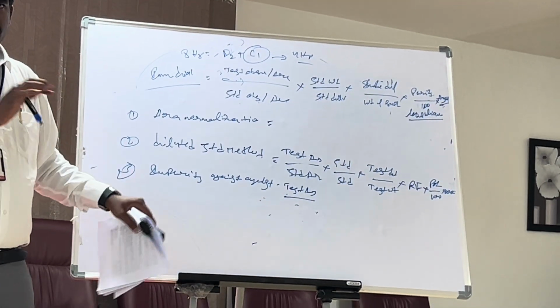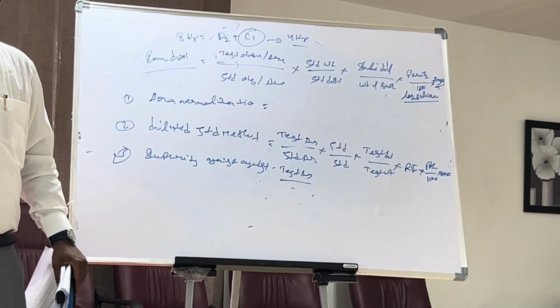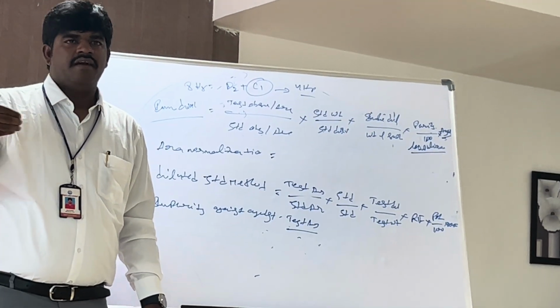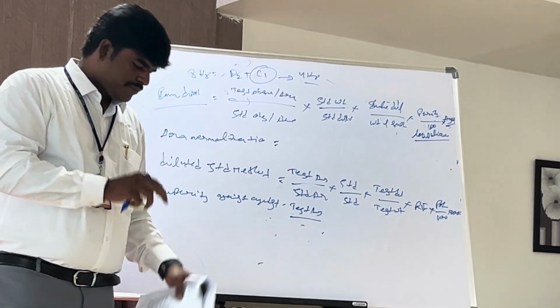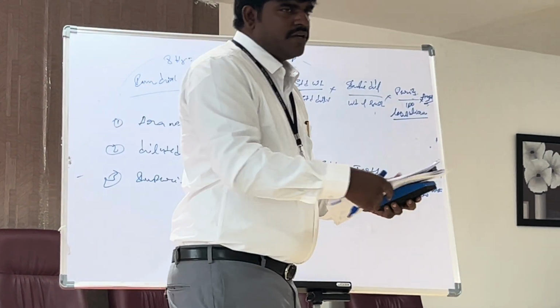Understand? So there are 5 impurities: related compound B sample area divided by related compound B standard area. If it is related compound C, you will enter the related compound C sample area divided by related compound C standard area. Understand? Or any other doubt? Okay? This is also similar.